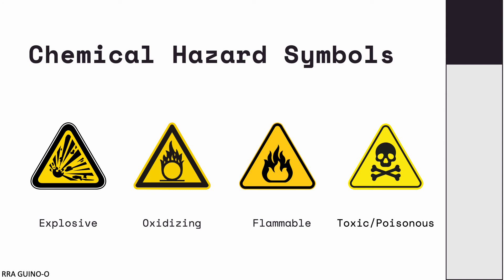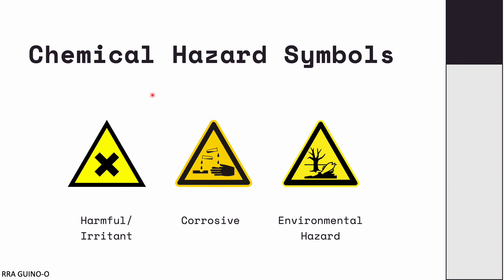Most chemical hazards have symbols indicating that they are dangerous, usually found on the container. They may have one or more of the following symbols: the symbol for an explosive substance, a symbol for an oxidizer, a symbol for a flammable substance, a symbol for a toxic and poisonous substance, symbols for harmful substances or irritants, a symbol for corrosive substances, and finally the symbol for an environmental hazard.